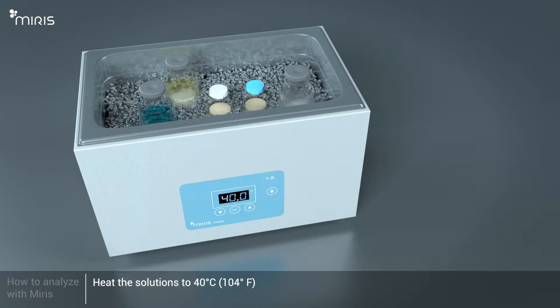Heat Meris Check, Meris Cleaner, Meris Calibration Control, and distilled water to 40 degrees Celsius.